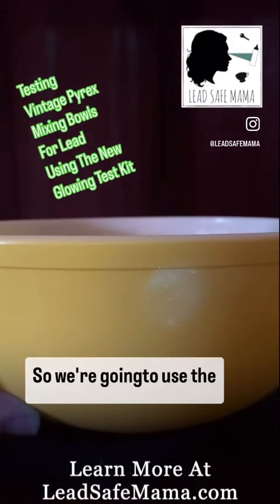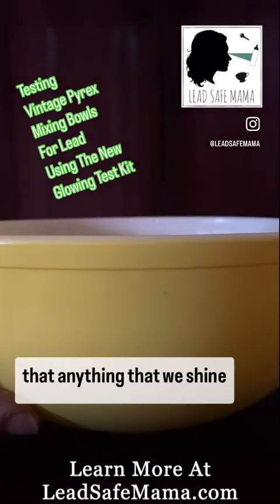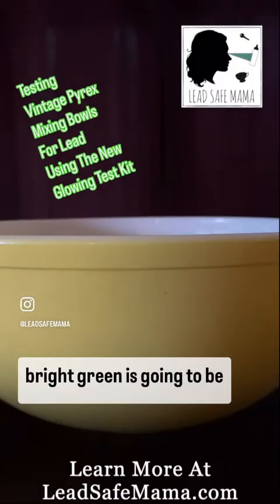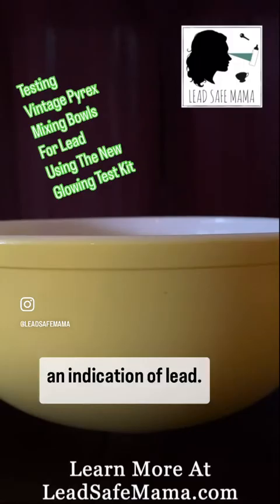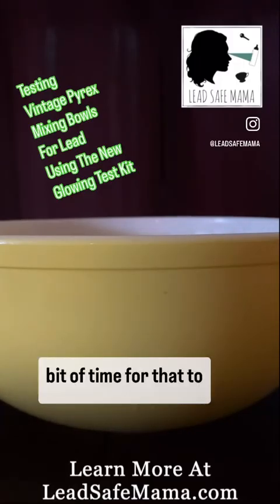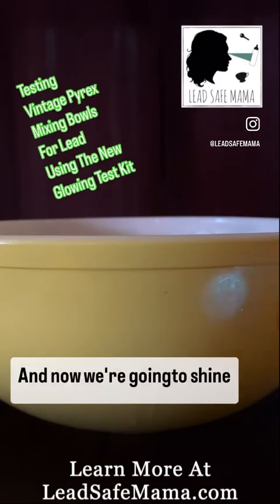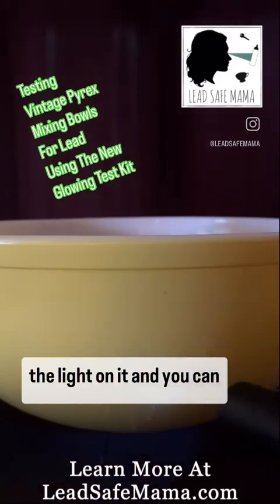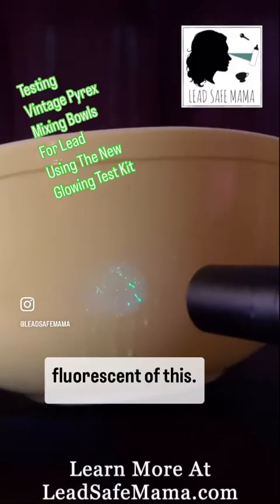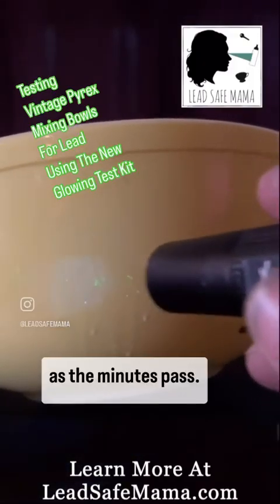So we're going to use the reagent. And once we spray that, anything that we shine the light on that fluoresces bright green is going to be an indication of lead. I usually give it a little bit of time for that to interact with the coating. And now we're going to shine the light on it — and you can see the really bright green fluorescing of this.